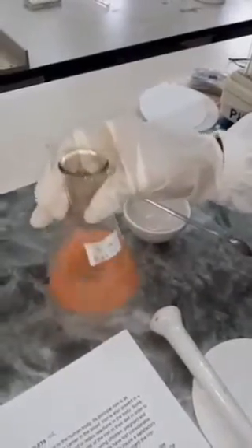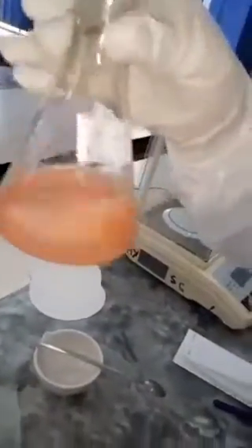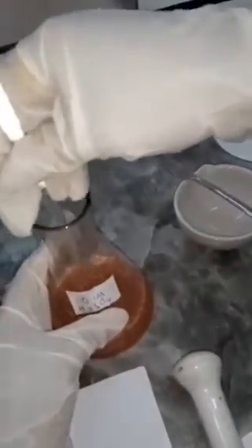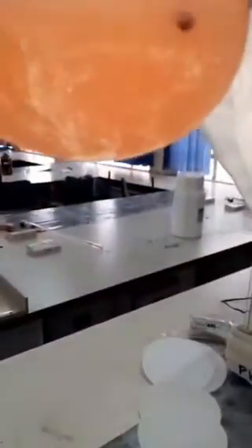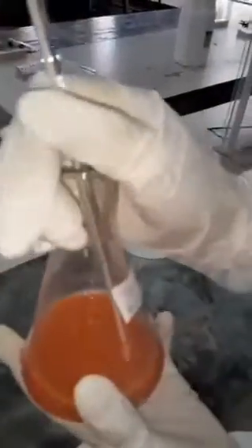So we're going to shake vigorously. If we notice that there are some lumps down, we can use a stirring rod to break them, so that we dissolve everything. At this point, the lumps are gone, but if you notice, we still have a bit of powder which is not completely dissolved. So in order to dissolve the rest of the powder, we're going to heat.